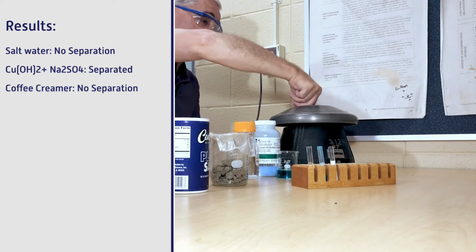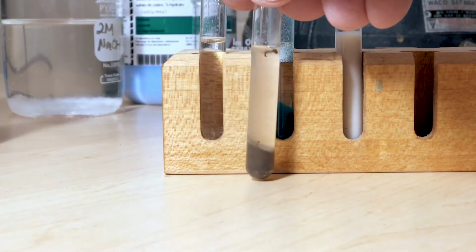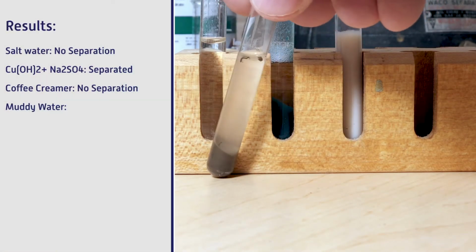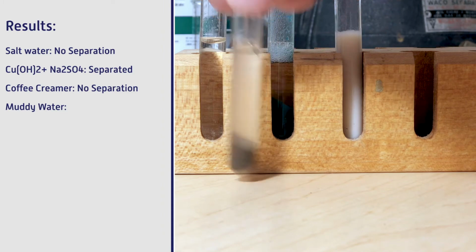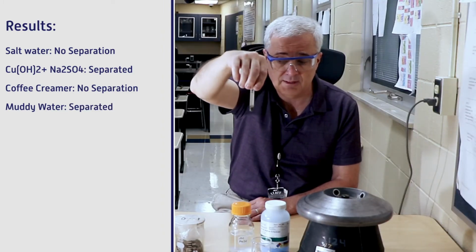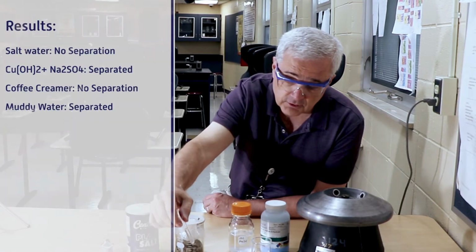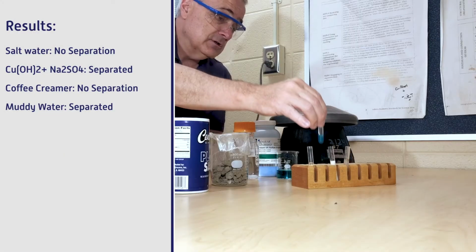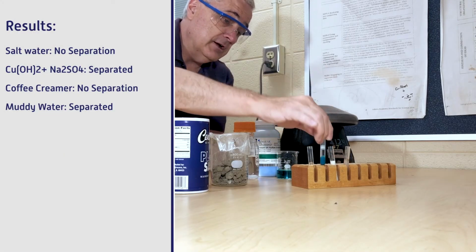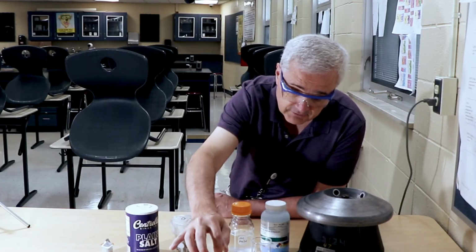There's no separation in the coffee creamer. And then the last results would be the muddy water. So now the muddy water has separated. We have the solids at the bottom, and then we have a stained, more or less stained liquid. It might be a colloid. It might be a stained solution. So there's your results. Results 1, sodium chloride, no separation. Results 2, we have layers. The creamer, no layers, and the muddy water, we have layers. So those are your results.